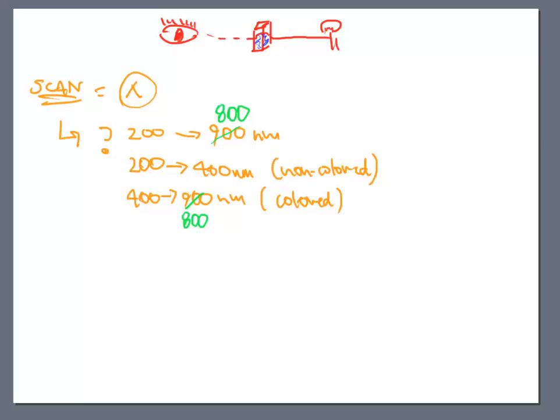You don't really know which one you've got until you actually just type it in. If it doesn't like the 900, an error box will come up and it says, nope, sorry, too high. So just go down to 800. And typically, for the most part, it will accept 800 every time. So this saves me a lot of work. It saves me a lot of memorization. And what happens is that it begins to scan that window.